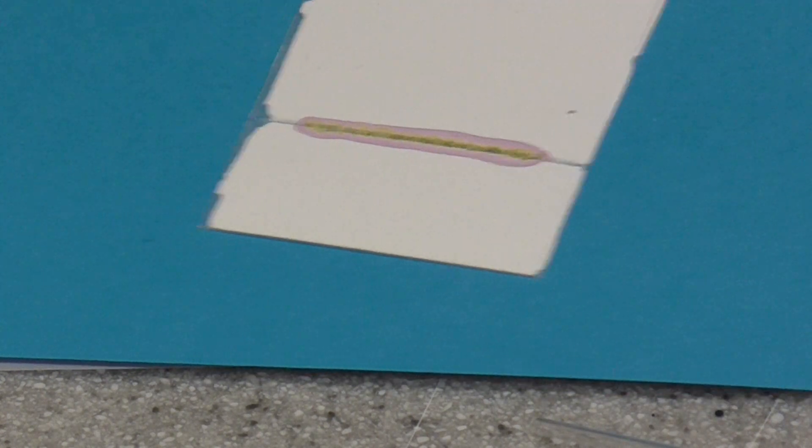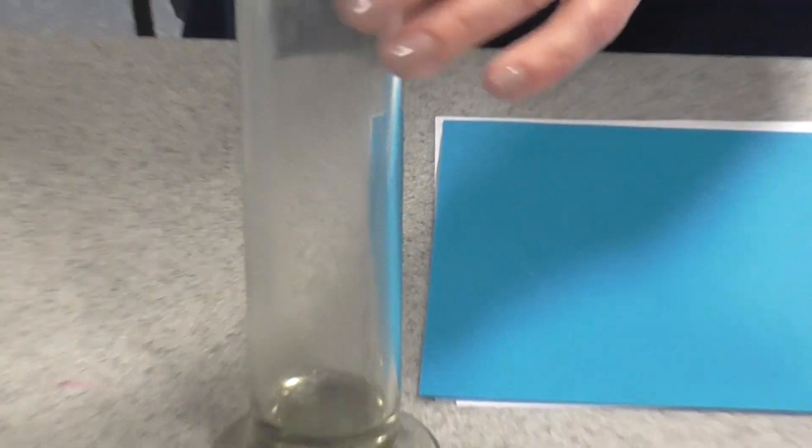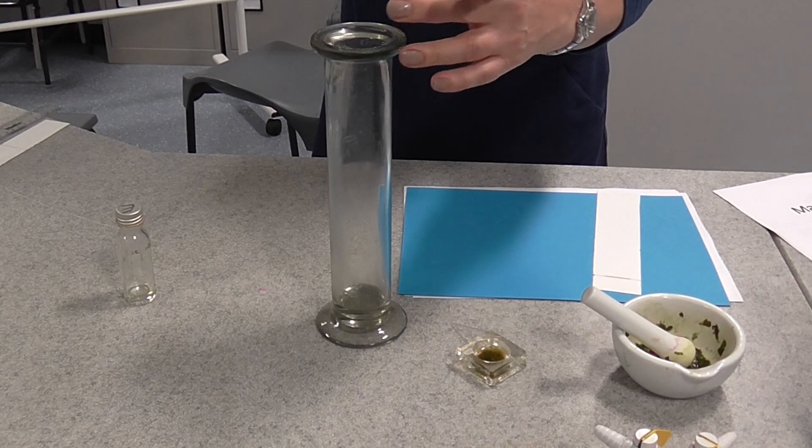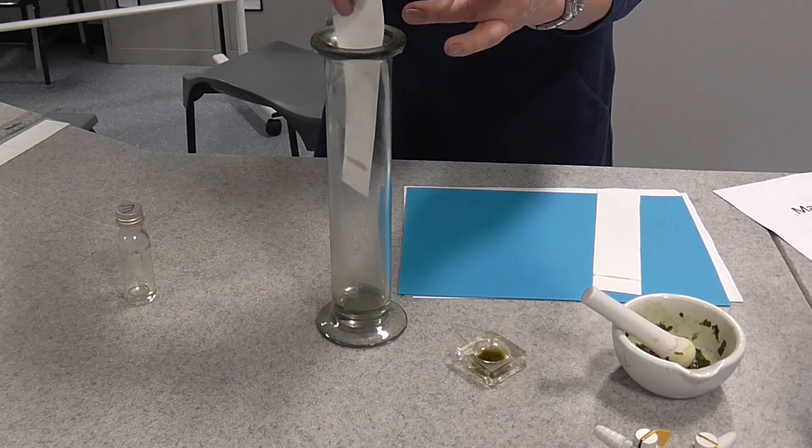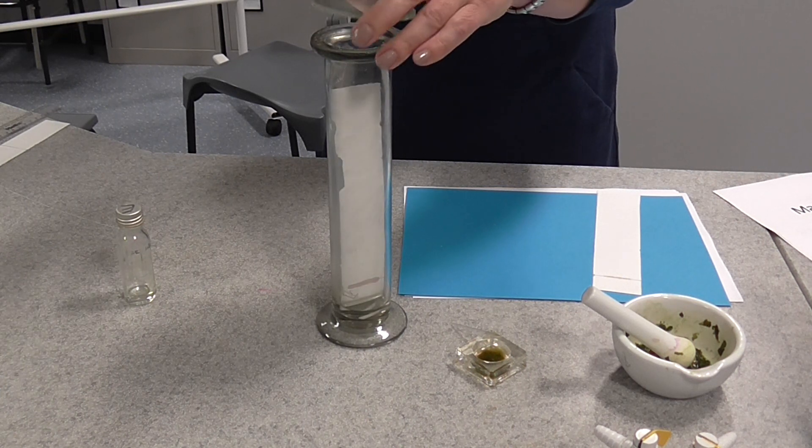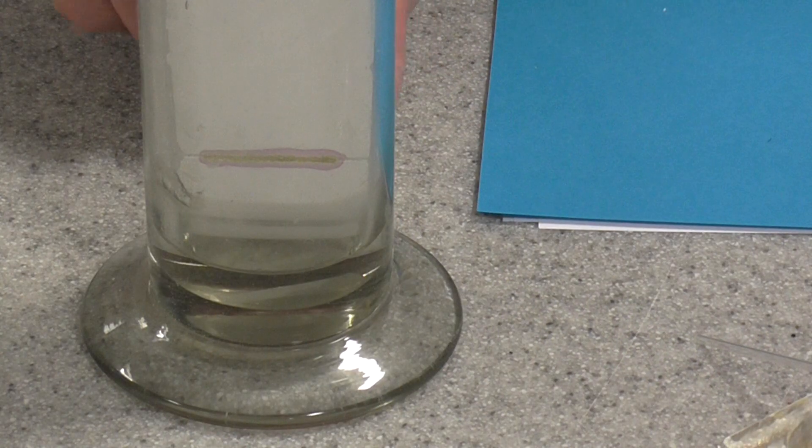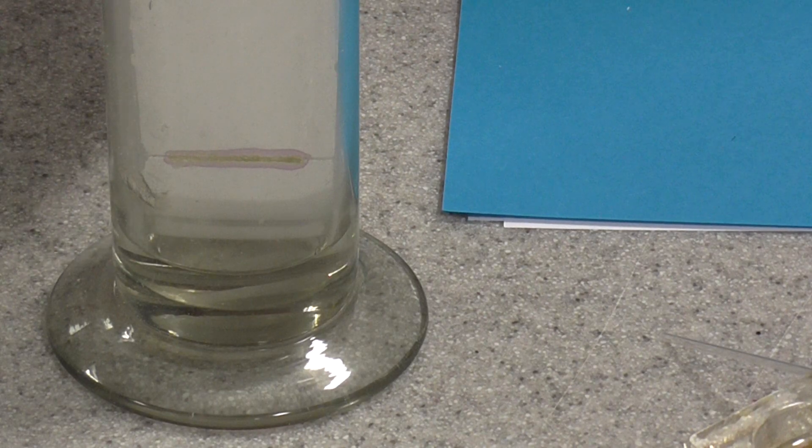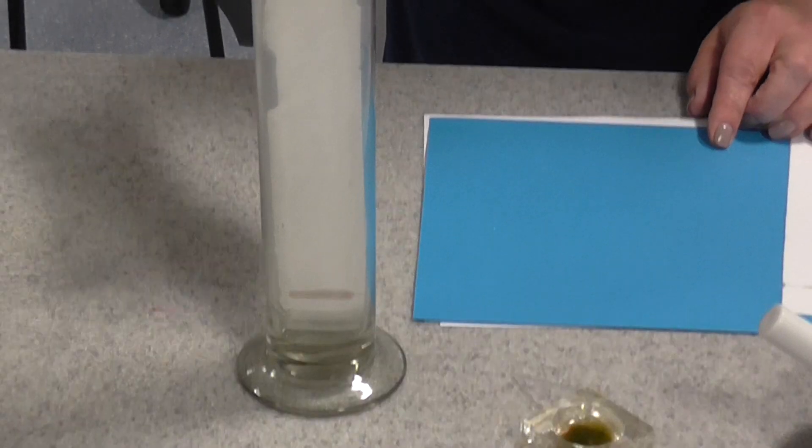Once you've done that and it's dried, you can place that inside the gas jar with the solvent. It's better if it doesn't touch the side. You're then going to leave that on the bench top and you're going to see the solvent slowly soak up the TLC plate and carry the pigments with it.